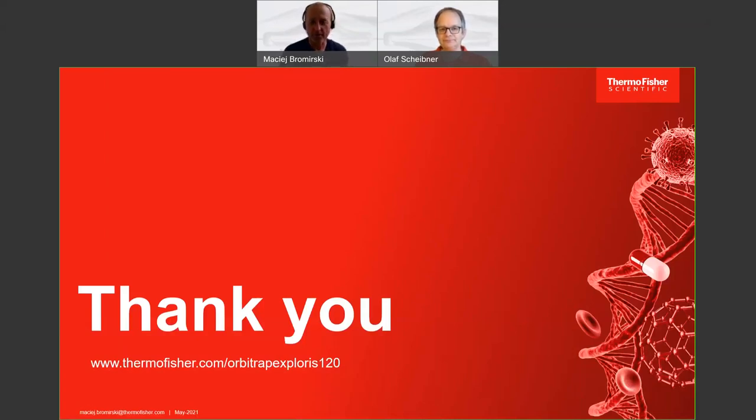Great, thank you, Olaf. This was a very, very interesting presentation. Indeed, it shows the power of Compound Discoverer software with the Orbitrap Exploris 120 and the MZ Cloud Spectral Library, which you nicely presented as well.